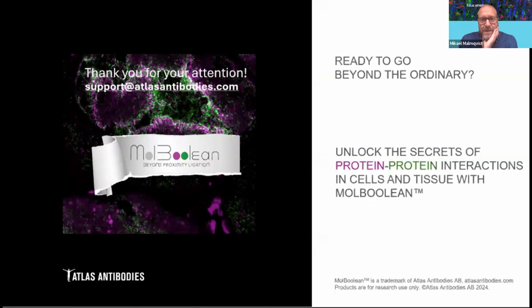Next question. Can I only use mouse and rabbit primary antibodies? I can answer that one. Yes, the product that we're offering here at Atlas Antibodies is only anti-mouse and anti-rabbit currently. In theory, you could use any species, so you could have your antibody probes in other species, but that's not offered by us at the moment.